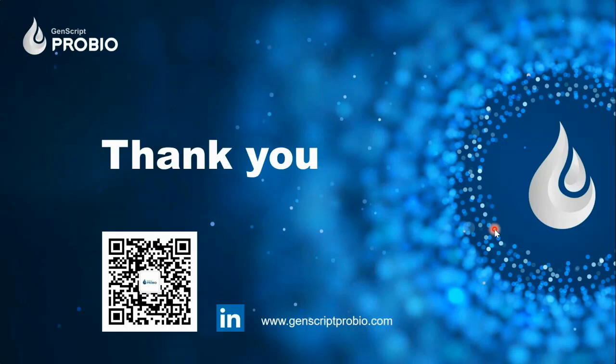It's a little difficult, actually. It just looks like you're filtering, but you need to know what kind of filter you're going to use, what kind of material you're going to use, and how much is the recovery. You need to understand a little bit about the filters as well. The most important, I would say, is that you even have to understand what charge the filter carries.